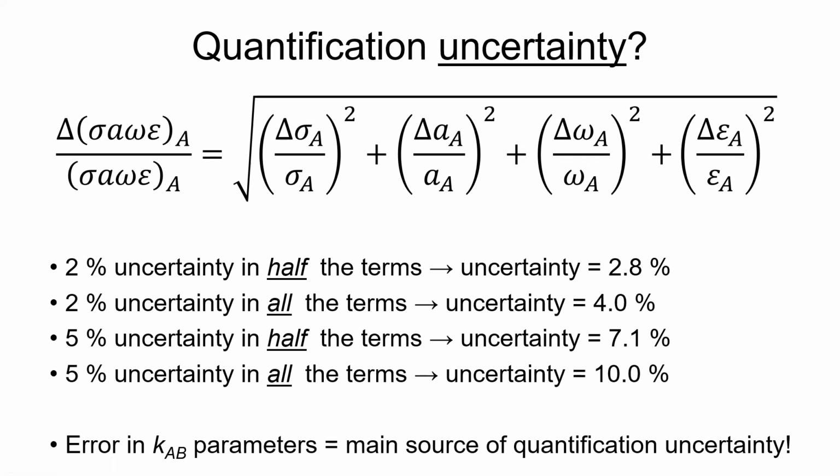And so, certainly, right, no pun intended, we don't know all of these to a high degree of accuracy, okay? So probably the term here that has the most uncertainty is the scattering cross-section, or the ionization cross-section, I should say, because those are being calculated theoretically from first principles. Very difficult to actually measure those experimentally, okay?